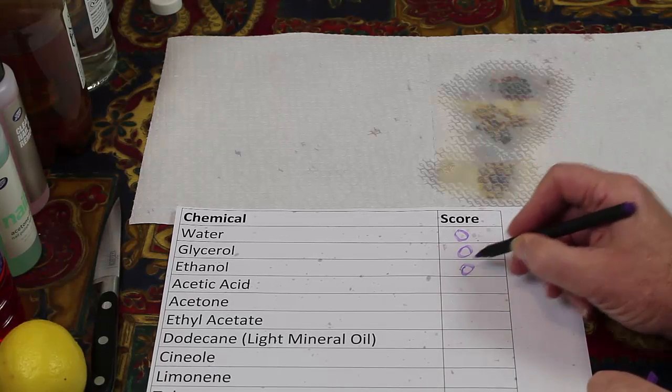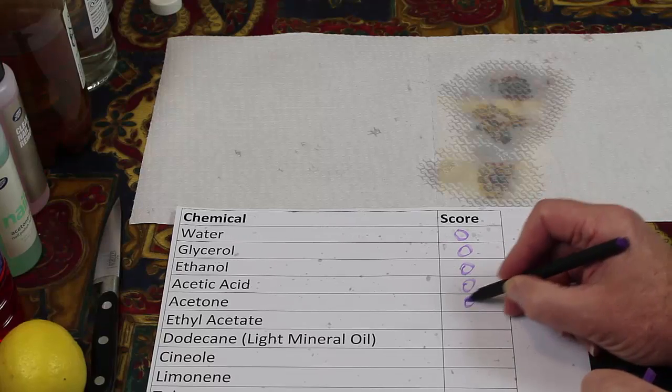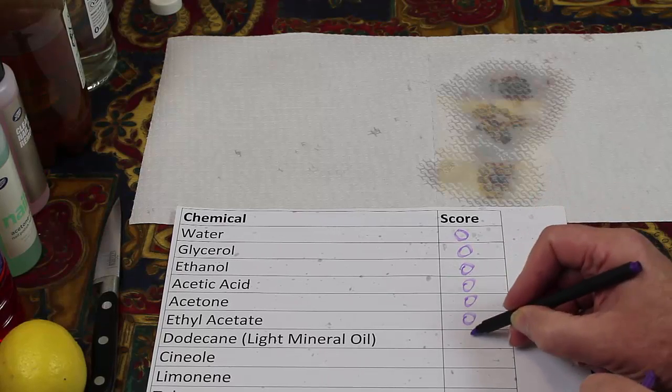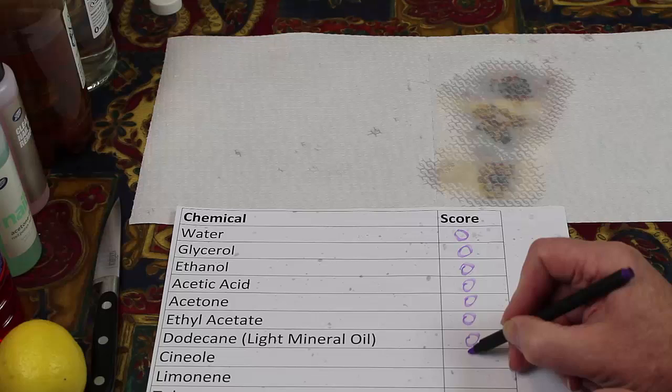So glycerol is zero. Ethanol is zero. Acetic acid is zero. Acetone is zero. Ethyl acetate is zero. Dodecane is zero. Cineol is definitely a one.